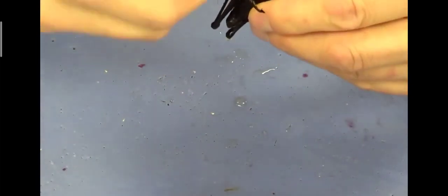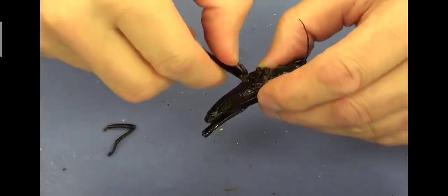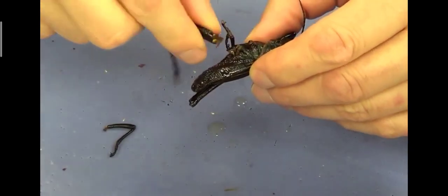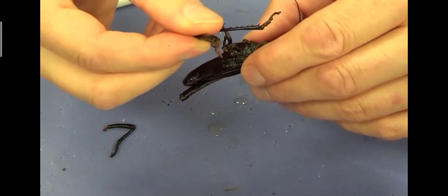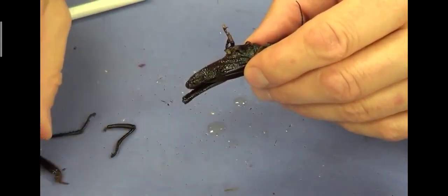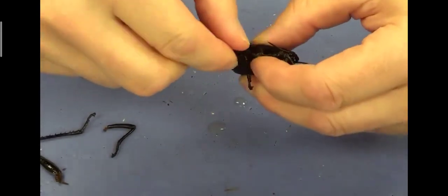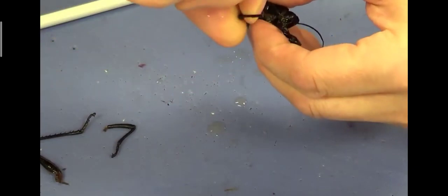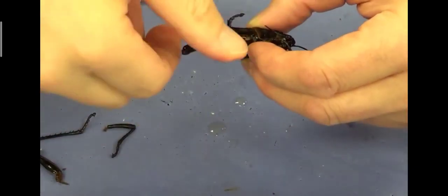Okay, now we'll take out all the legs and dissect them. For the dissection, first of all we twist the legs and move them out. Okay, in the legs you can observe there are 5 parts. The first is the coxa, then comes the trochanter, then the femur, then the tibia and the tarsus. Now the tarsus has spine-like structures as already shown. Okay, so in this way we'll take out all the legs.